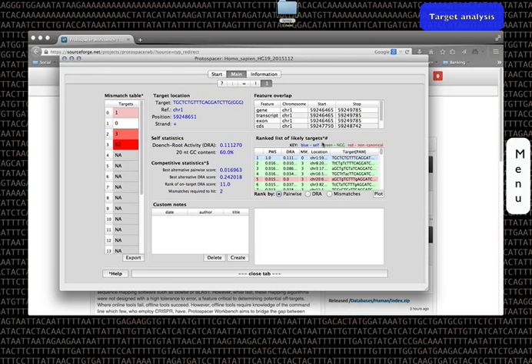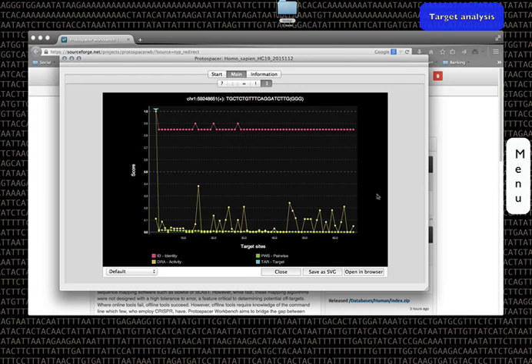After double-clicking on a target, I've been taken to the results screen for the guide-RNA. There are many statistics shown on the screen. Take your time, pause the video, and read the descriptions. This plot provides a graphical summary of the guide-RNA's performance. The title of the plot is the intended target site. The x-axis is the rank of each target site, with the leftmost targets being the most likely.